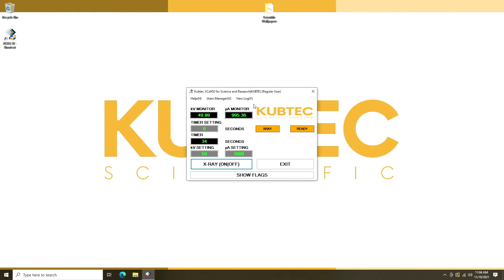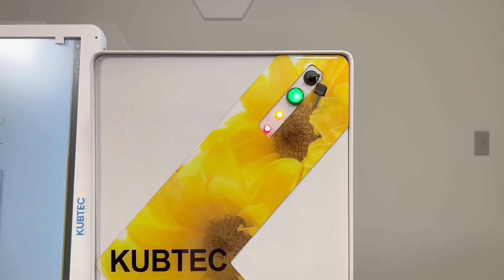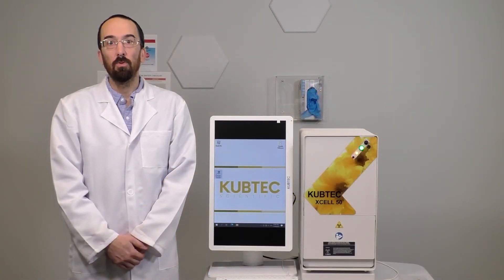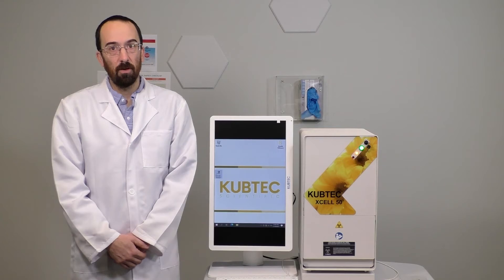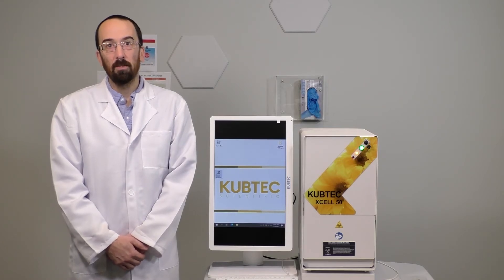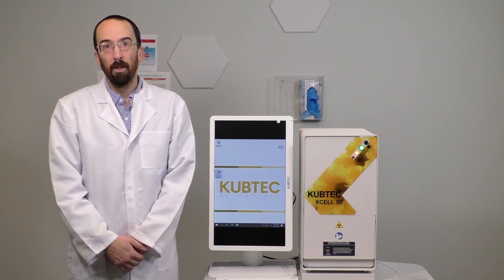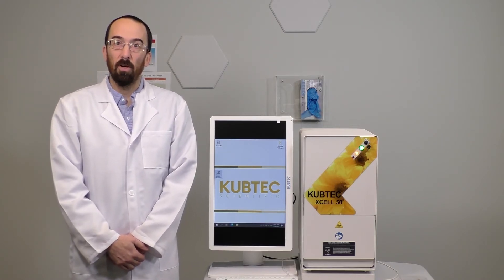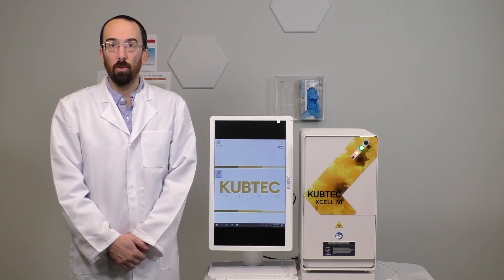The system will activate, which is indicated by the orange and red lights on the screen and on the system. Like all KUBTEC XCELL irradiators, the XCELL 50 has a user-friendly interface based on the Microsoft Windows 10 platform for maximum security and flexibility. The XCELL 50 also has remote support capabilities, enabling diagnostics and software updates with minimal disruption to your work.